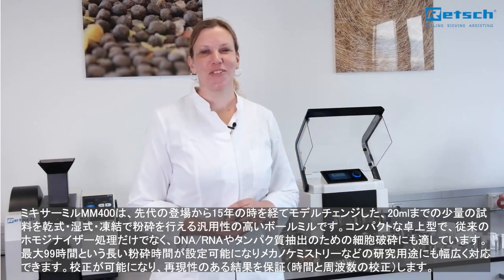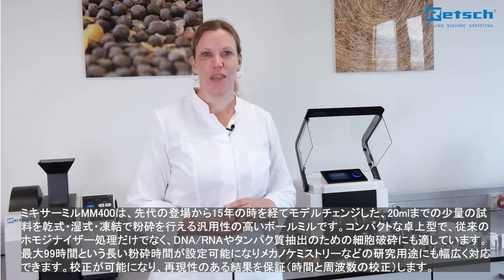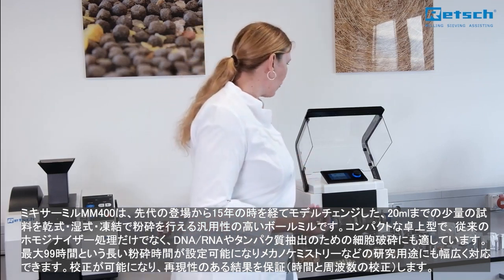Hello everyone, my name is Dr. Tanja Budd and I'm working as a product manager for Retsch. Today it is my pleasure to introduce our new Mixer Mill MM400.